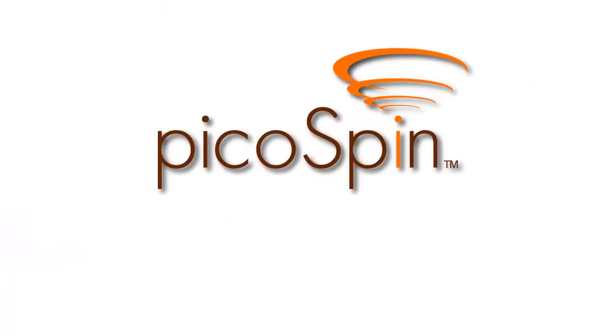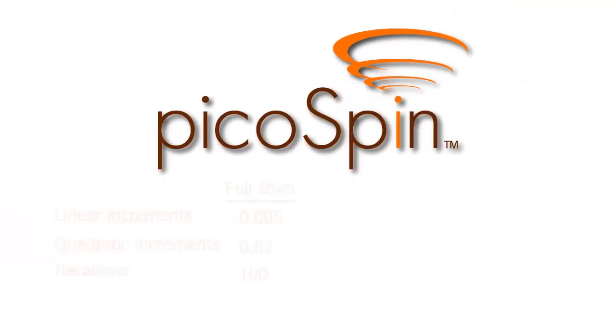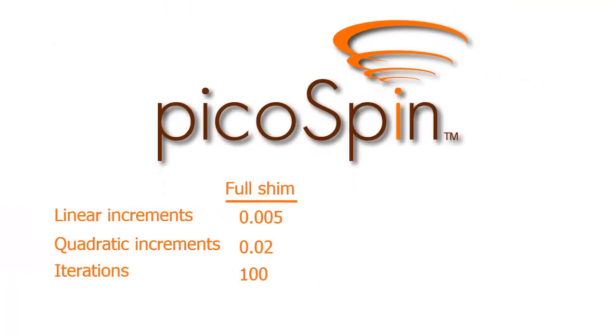The maintenance shimming procedure described here uses very robust settings that will work in all cases. If your instrument is left powered on all the time and you shim it regularly, you may find that you can get the same results with a quicker procedure, where you only adjust the three gradient shims, X, Y, and Z, and only run 30, 40, or 50 iterations.